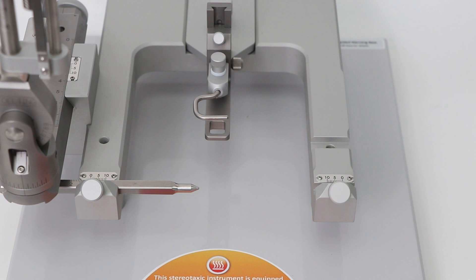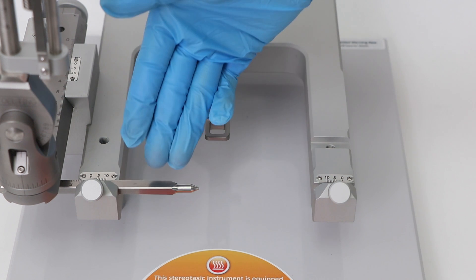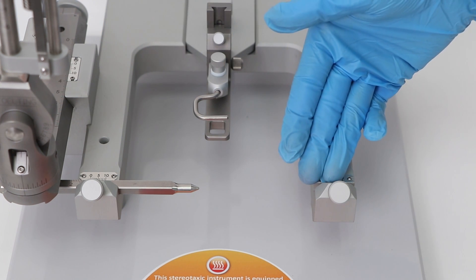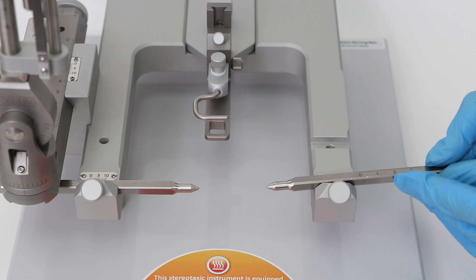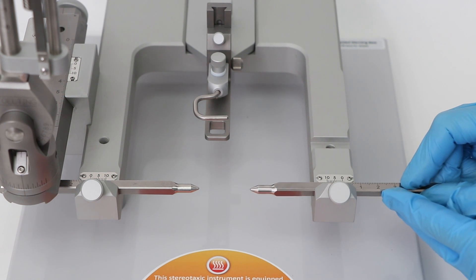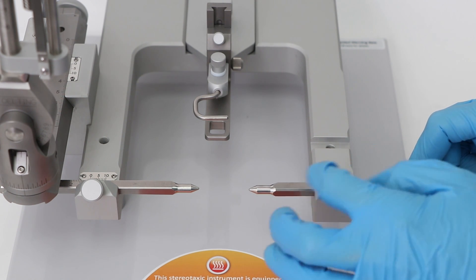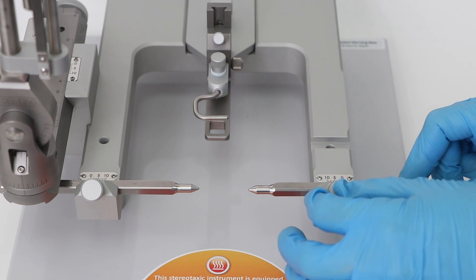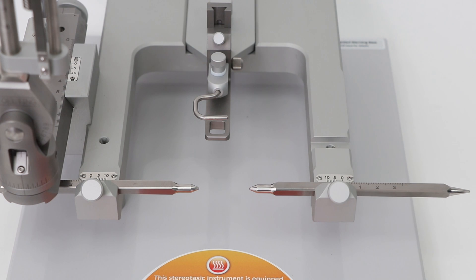For surgical applications using a rat, attach metal ear bars here and here. Do not over tighten them as these will require adjusting to situate the animal properly. Only fully tighten them once the animal is in position.